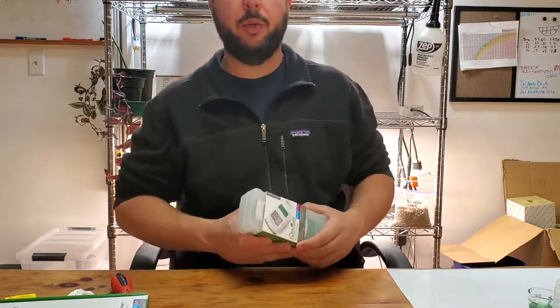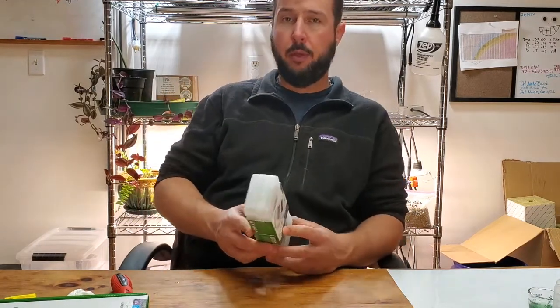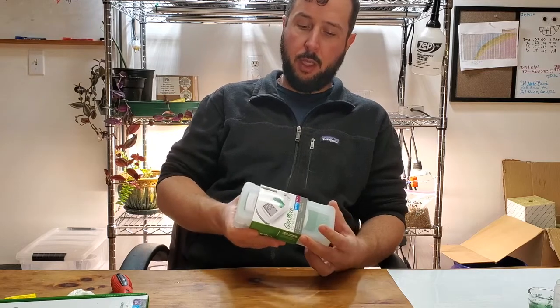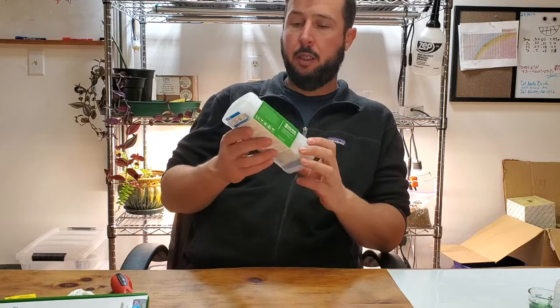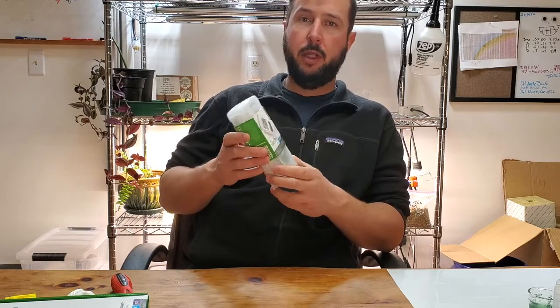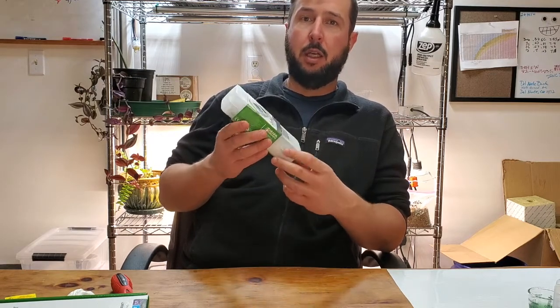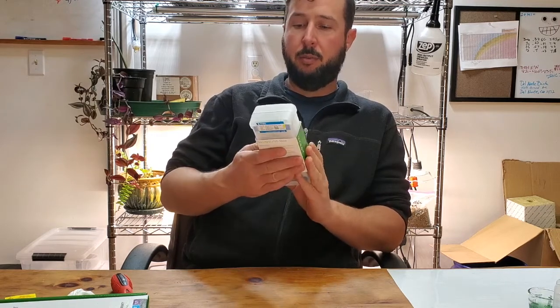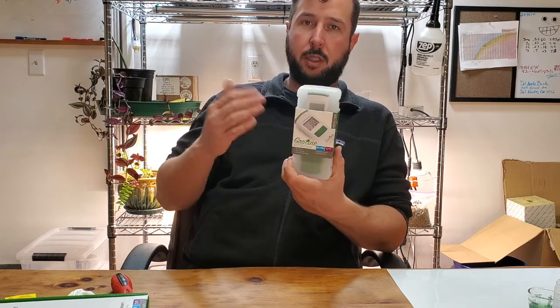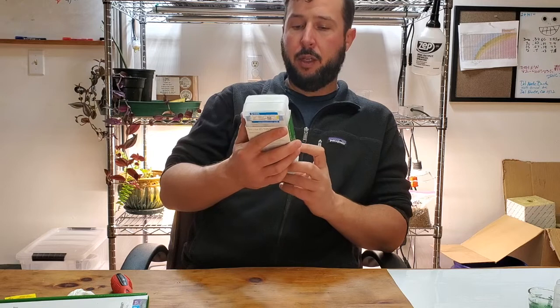Hey there folks, this is Brian Gandy with Sustainable Terrains, and I'm going to do a quick tutorial on the Hanna Instruments grow line 98318. This is an electroconductivity or total dissolved solids meter — EC or TDS — given in parts per million. It's also got a temperature sensor, since this is a temperature-dependent thing that you're testing.